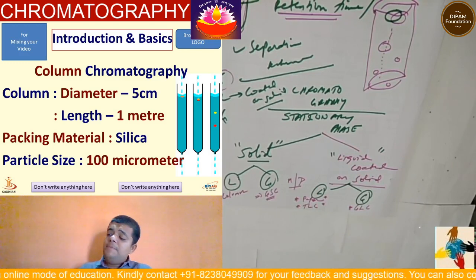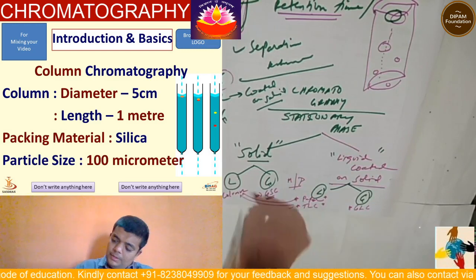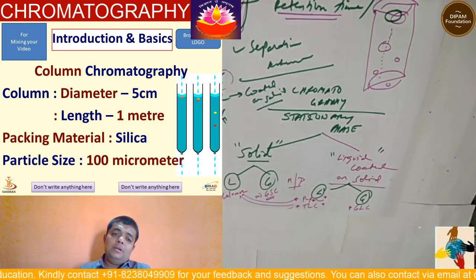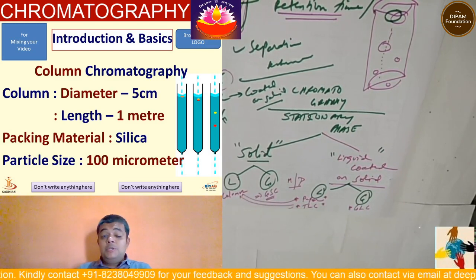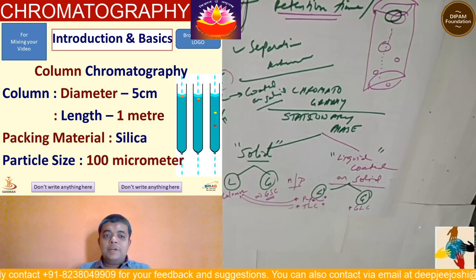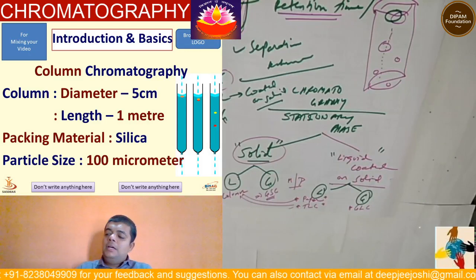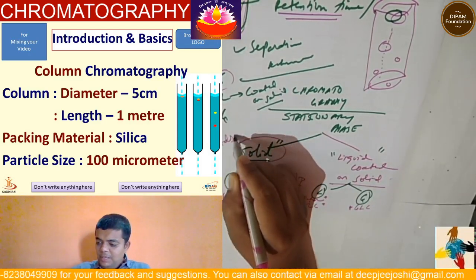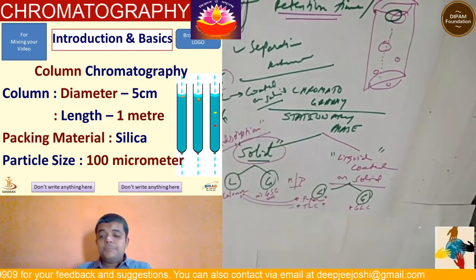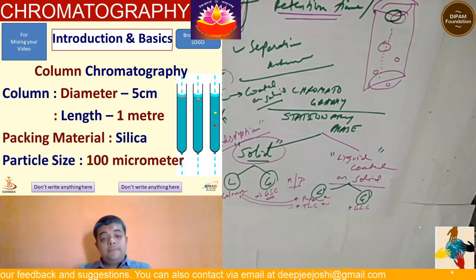I have seen people sometimes keeping these techniques over here. You can keep them for a while in this combination of liquid solid chromatography, but when you go through the mechanism they follow, you cannot. For example, when you say that you have a solid stationary phase, it always undergoes a phenomenon of adsorption for this separation. And there, this fails a bit.